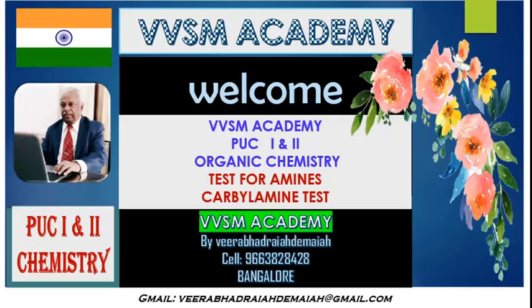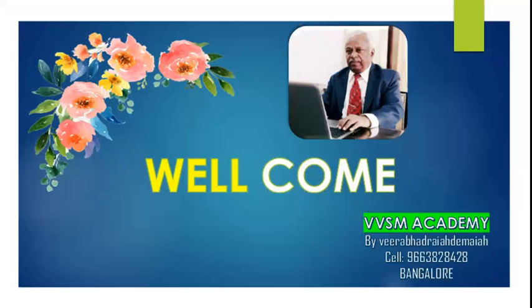For organic chemistry, we have studied so many things in the amines chapter. I would like to conclude by taking this class today, the tests for amines, particularly tests for primary amines, secondary amines, tertiary amines, and other types of aliphatic and aromatic amines. The carbylamine test is very important for today's lesson.